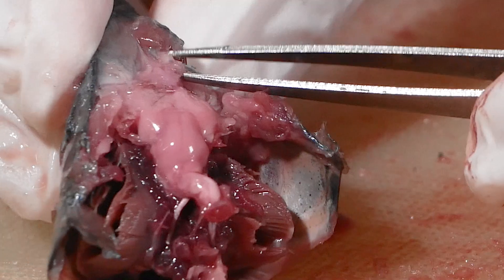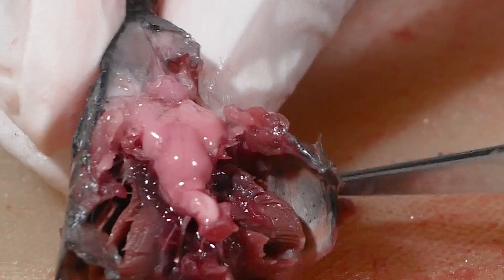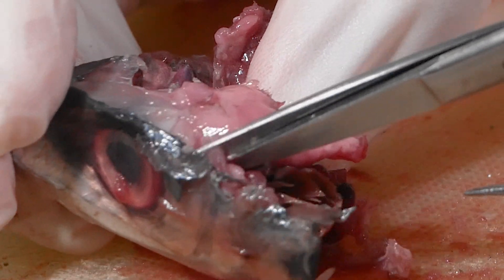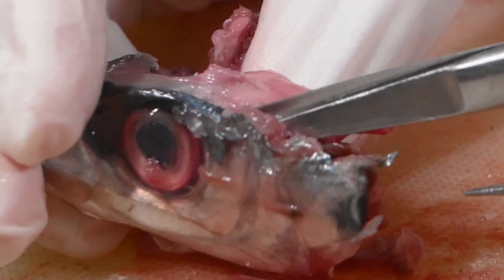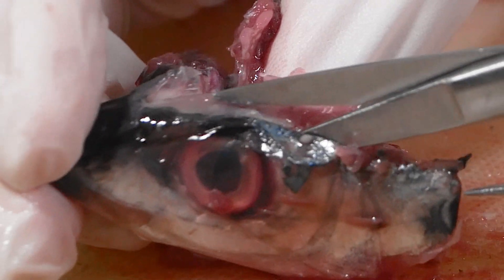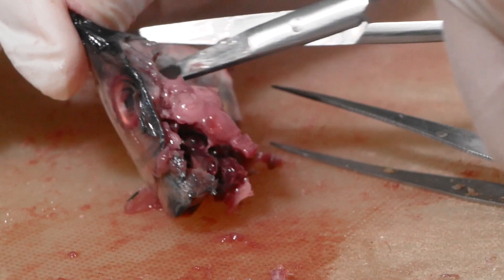Remove the tissue surrounding the forebrain, being careful not to damage the olfactory bulbs. Once the dorsal part of the skull is removed, start working on removing the ventral portions of the skull. At this point, the brain is now more or less exposed and the major parts are visible.